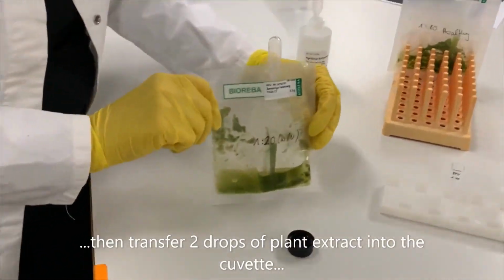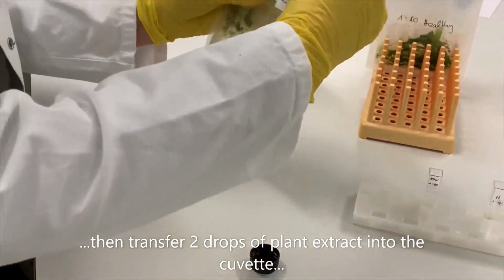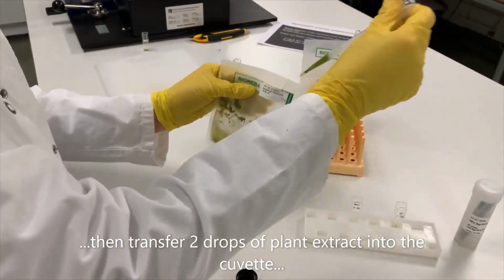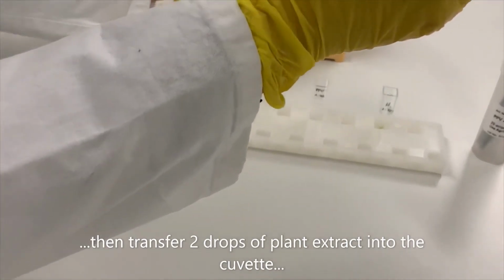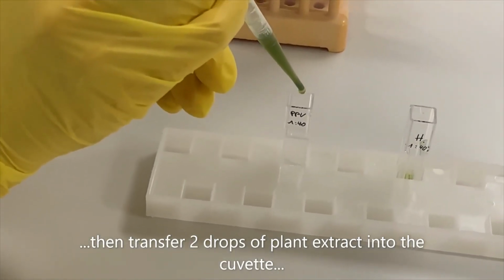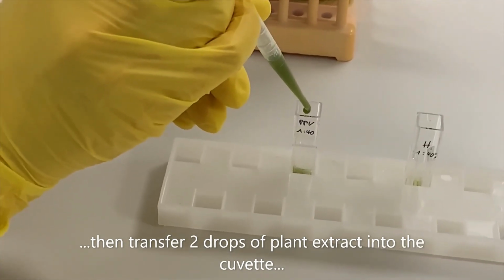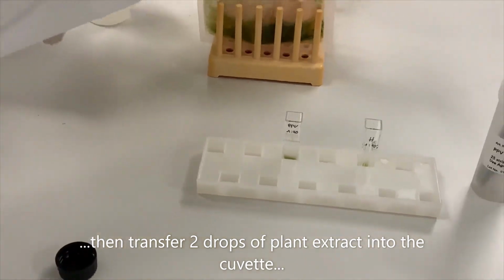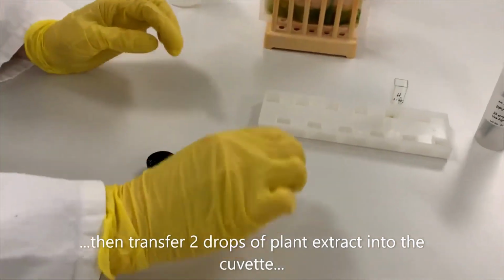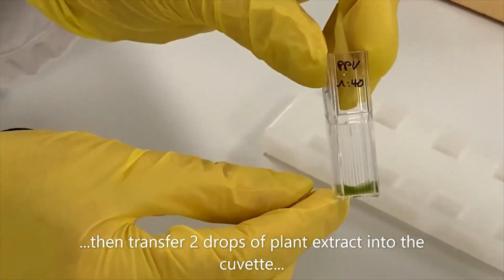And then we take 2 drops from our 1:20 diluted sample to have the optimal dilution of 1:40. We put the liquid to the bottom and are ready to insert the strip.